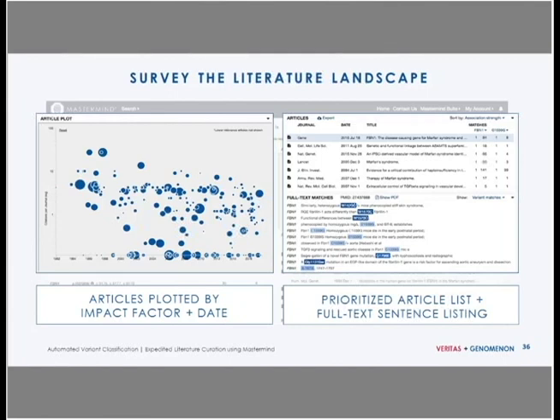So it depends on what your clinical question is as to which area of that plot you focus on. But then I think critical to the success and the high degree of utility of the Mastermind interface is we don't expect our users to take our word for our various assertions and prioritizations, we show the evidence that indicates that, in fact, this reference is talking about the variant that was searched for and is, in fact, pertinent to the user's clinical search. And a couple of ways to exemplify that. One is that we show that match frequency that I was describing.